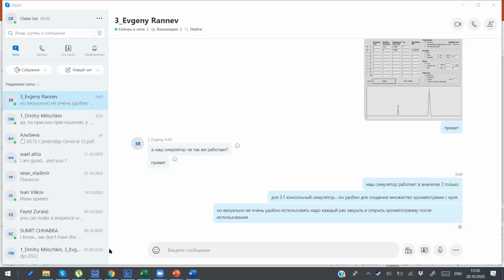What about ASTM D3588? I really don't know, because I haven't made this request before. So I will forward this question, Valera, to our laboratory. Does the software meet CFR 21?